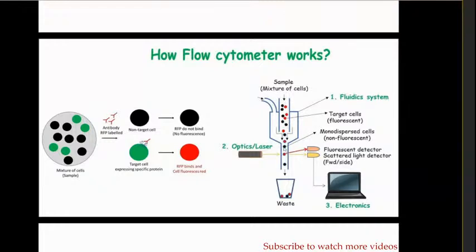In the path, it allows only one cell alone. If there is a needed cell, if they fixed the wavelength, for example, I mentioned if there is a red signal for the target cell, the detector recognizes the signal, or that color intensity, and activates the sorting machine. Sorting machine means collecting. Here in this bucket it's shown the waste material.